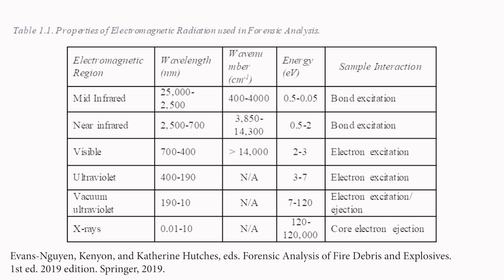And the kind of interaction you're going to have with the sample at that point is you're not even really messing with electrons. You're actually just sort of causing bonds to vibrate or bend or wiggle. You're exciting the bonds just a little bit. You're not near breaking them. It's very gentle. And we'll look at some animations showing that bond excitation. Okay, but you're not really even pushing electrons around.